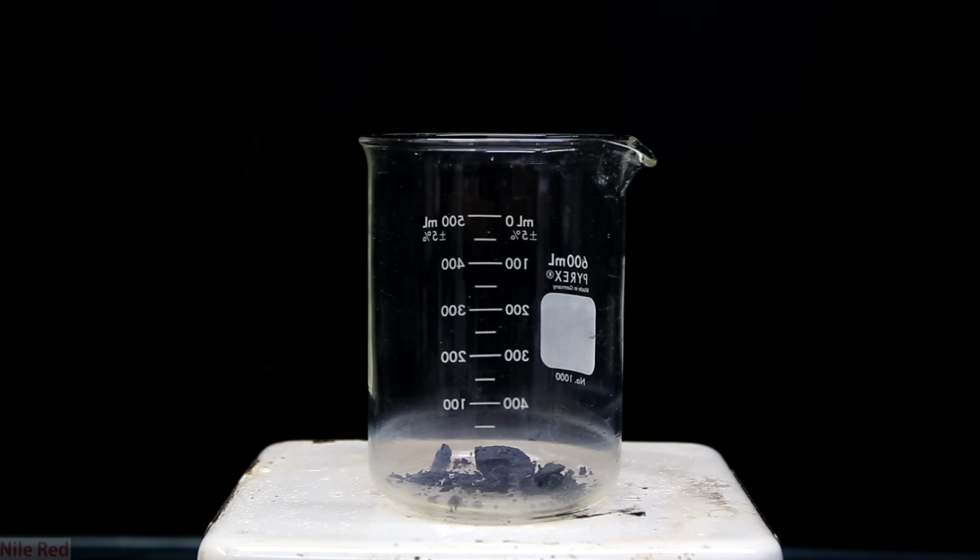Before I start with my explanation though, I want to be very clear and state that it is true that iodine does sublimate at room temperature. However, what we're doing here is we're heating the iodine, which is different than letting it just sit at room temperature. When the iodine is heated, it does become a vapor, but first it actually does pass through a liquid phase. There's actually a really large window between about 113 and 184 degrees Celsius that it exists as a liquid. So if we heat iodine, we can't say it's being sublimated because it's not going directly from solid to vapor, it's going solid, liquid, and then vapor, so it's more being evaporated.